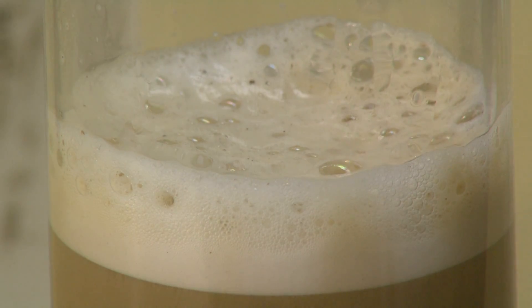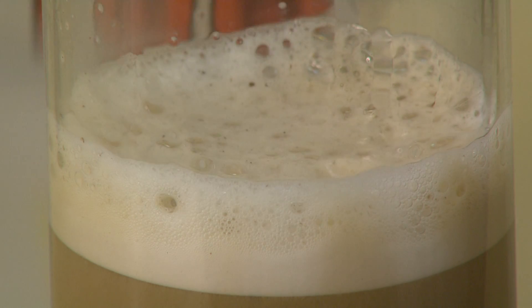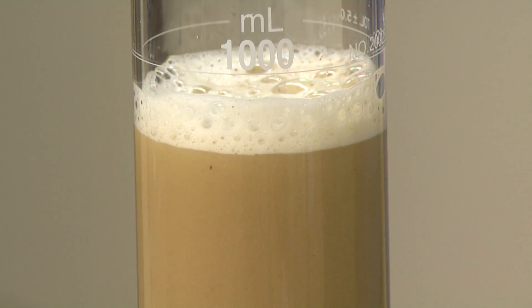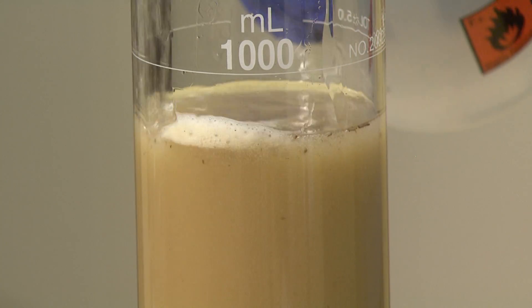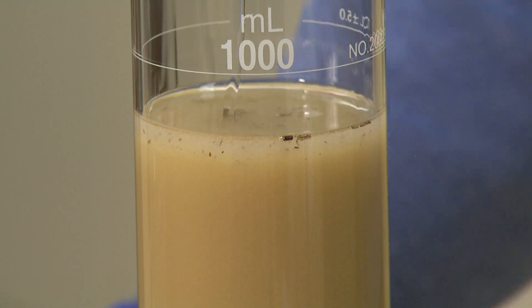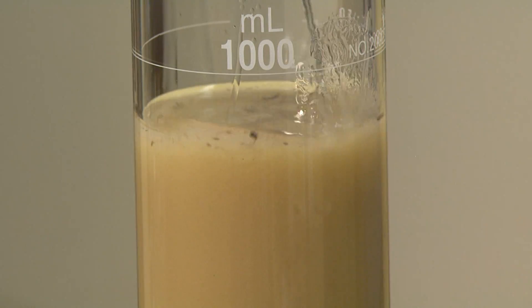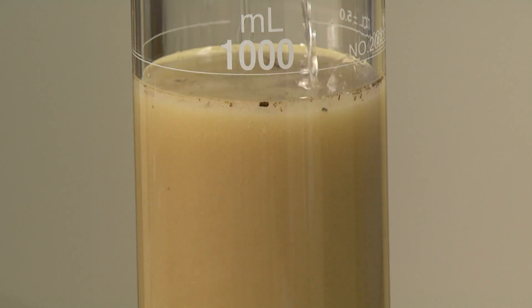Occasionally, some samples will generate a small amount of foam during the mixing process, which can obscure reading the hydrometer. Should this happen, the foam can be eliminated by adding a small amount of ethanol or a drop or two of amyl alcohol to the cylinder. This will reduce the surface tension of the foam's bubbles, causing them to burst and the foam to subside. This should be done prior to filling the cylinder to the 1,000 milliliter line.